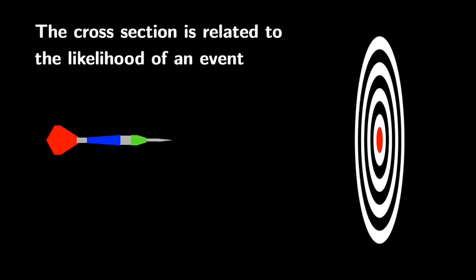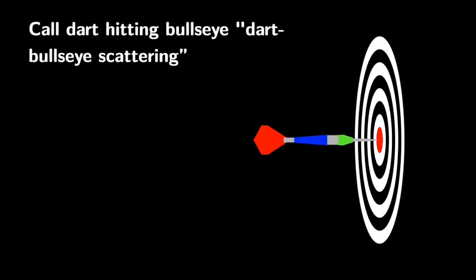Essentially, what are the parameters that we need to use in order for the electron beam, which is here represented by the arrow, to hit the target? This is what we've done. I hope this presentation was helpful in trying to explain what's going on during sputtering. This is a theoretician's perspective. I tried to link this to experiment to show you how we can understand what's happening and explain the different scenarios, and I hope it was convincing.